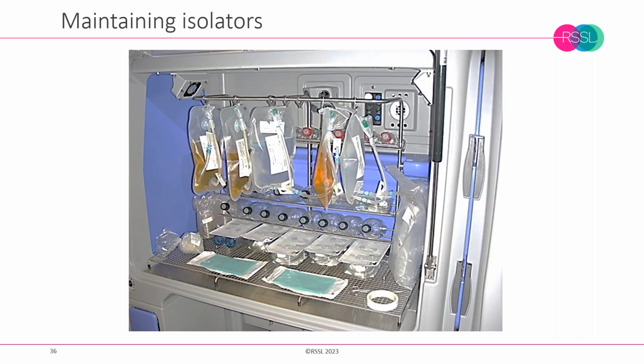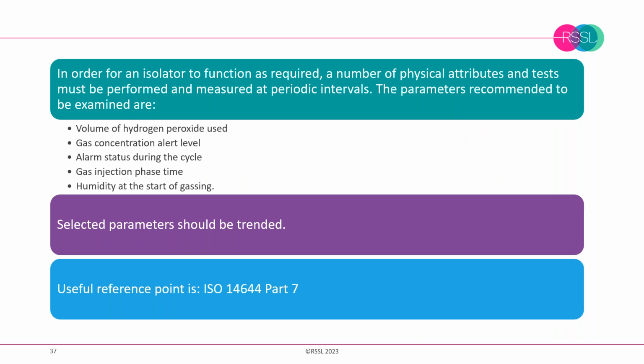Okay, so just to wrap up, there are some important parameters that we need to understand and monitor to make sure the isolator is operating correctly.